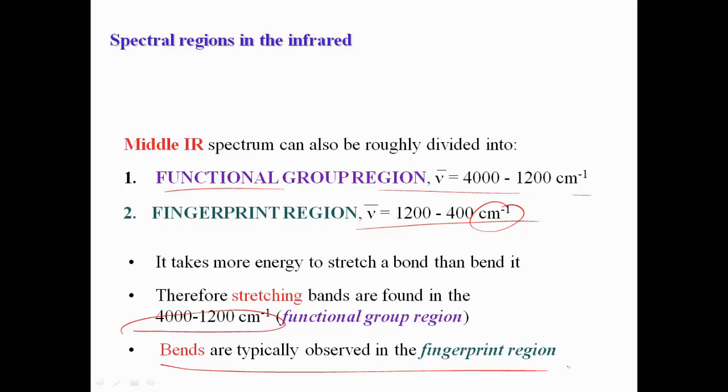So this is the type of analysis an infrared spectroscopist has to go through in general. If you have your molecule, you run the infrared spectrum, and you want to know what the structure of it is. You look for these functional groups first, and then you might look in the fingerprint region. These will be stored in a library. Does it match with any molecule that is known?